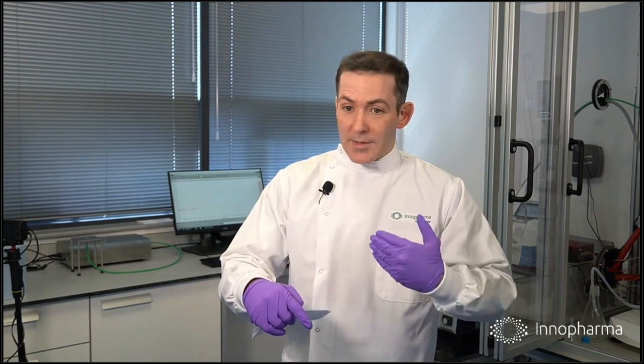Is there a sampling rate? There was a previous question. I'll come back to that. So really, inline is real time. It depends on what you're using. I think that's actually related to the sampling rate question. Many instruments are like opening the shutter on a camera: it takes a certain amount of time for enough light to hit the sensor. It depends on the sensitivity of the sensor. You allow it to acquire for long enough to detect a strong enough signal. So that's what determines the sampling rate.